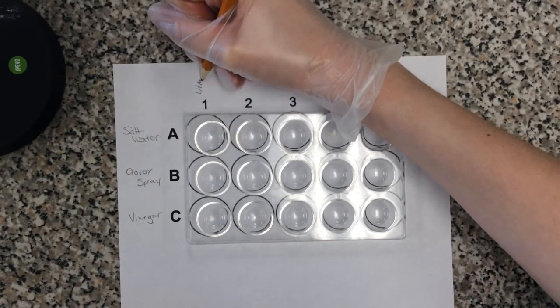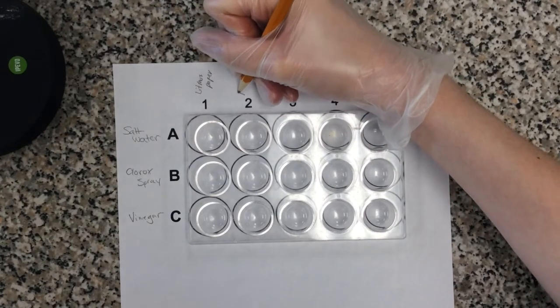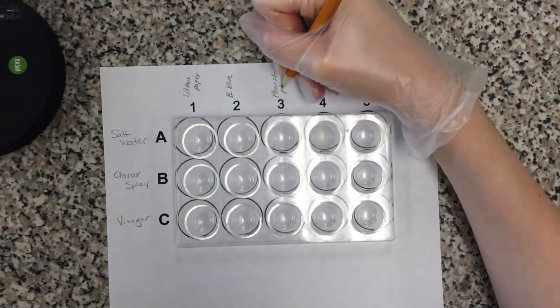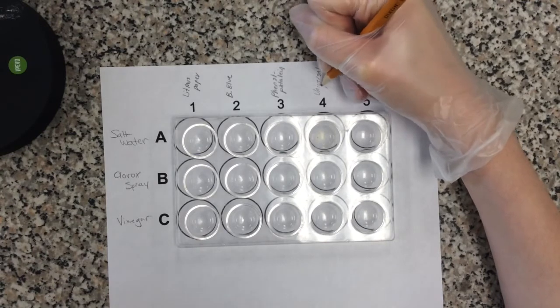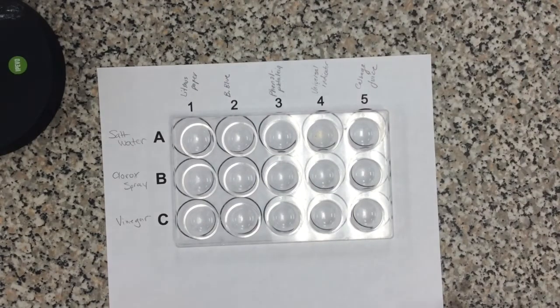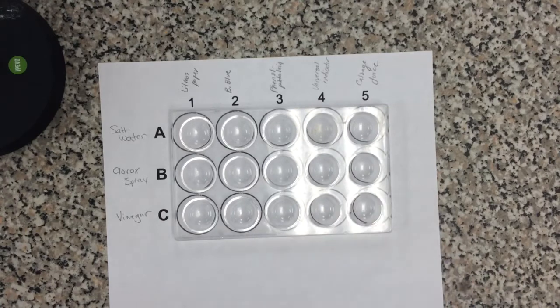So we'll do litmus paper. Sorry. Okay, guys. Blue litmus. Phenolphthalein. Universal indicator. And cabbage juice. All right, so let's get started.